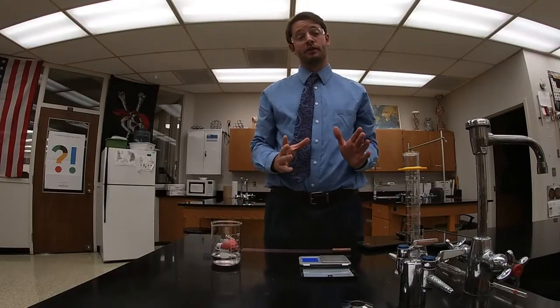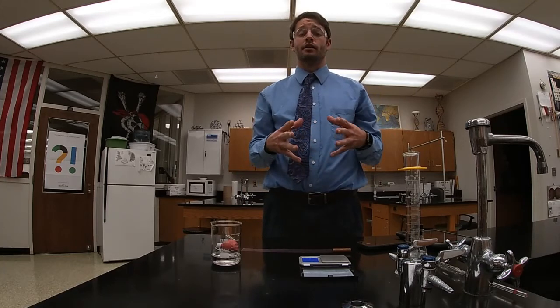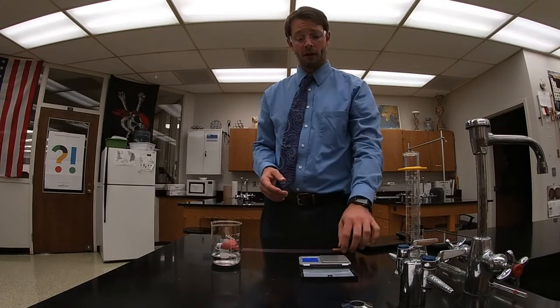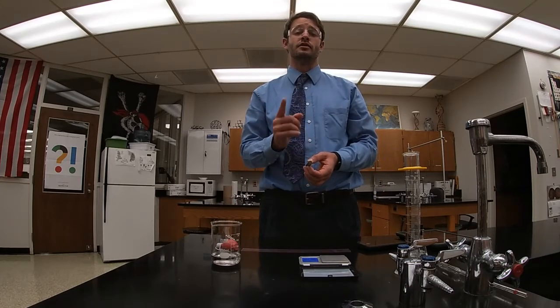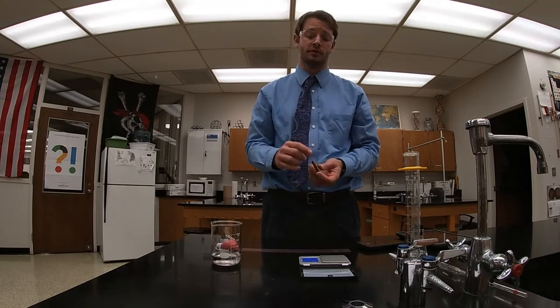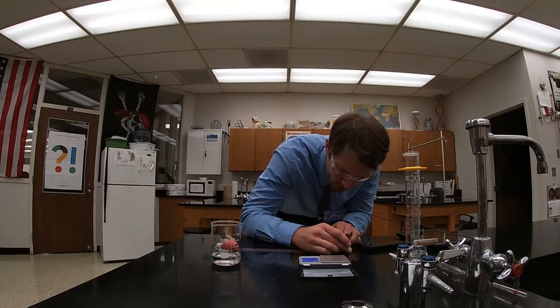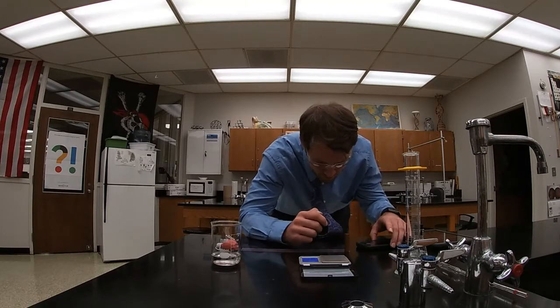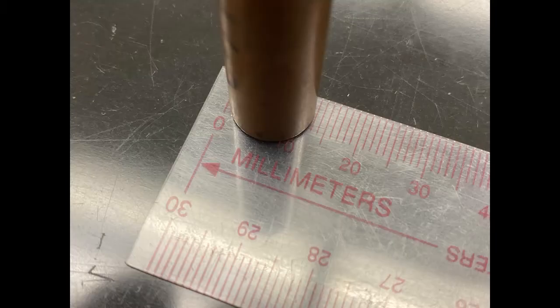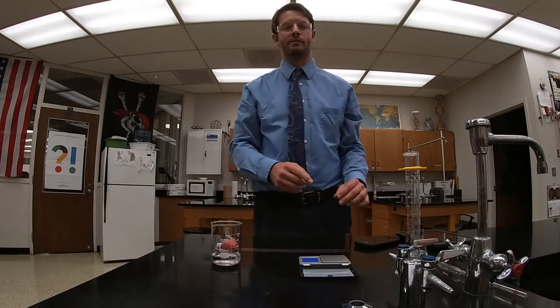Because the volume of a cylinder is pi r squared times the height, I just got the height. Now I need to get r, which is the radius. I'm not going to effectively measure the radius because I have to find the center, so instead I'll measure the diameter and divide by 2. So take the diameter of the cylinder and divide by 2. So I'm lining up with the edge. So you'll take that diameter, divide it by 2.